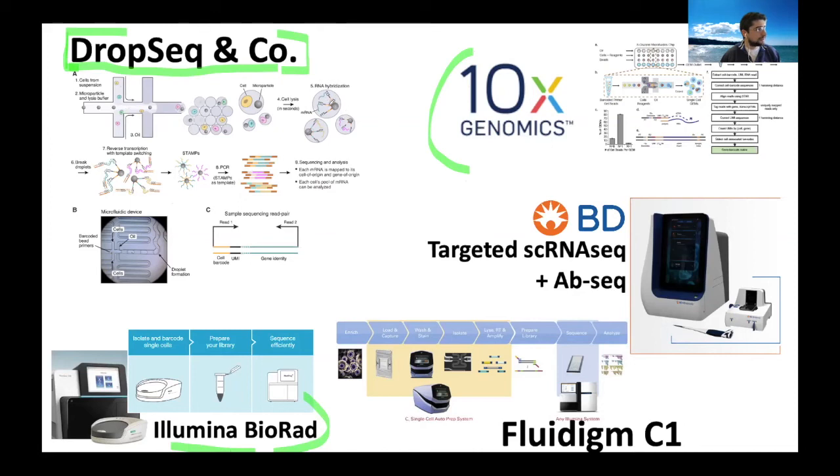Okay, and the barcodes that are present on the beads are specific for each cell. Each bead will have a different barcode compared to the other beads. You see here you have orange, you have light blue, and yellowish maybe. So they're basically just different barcodes.